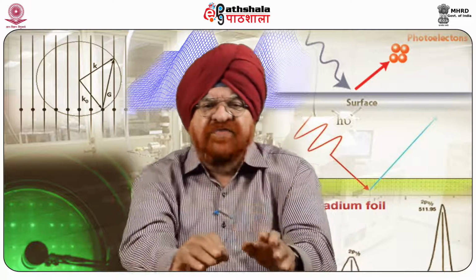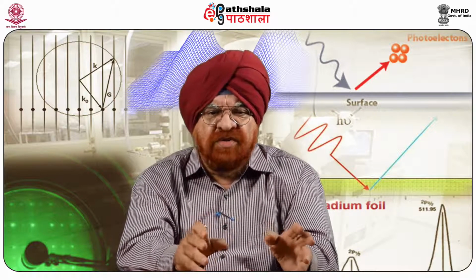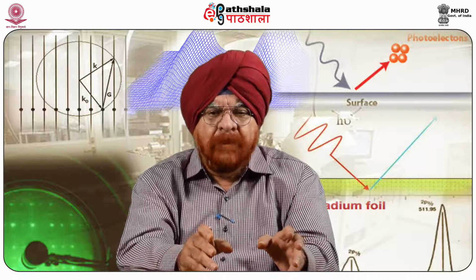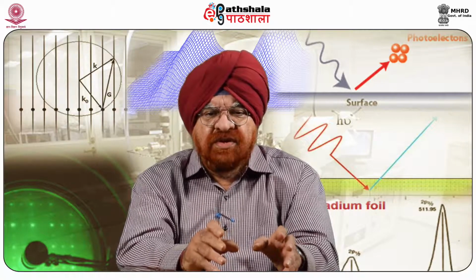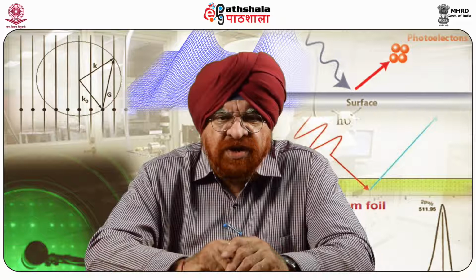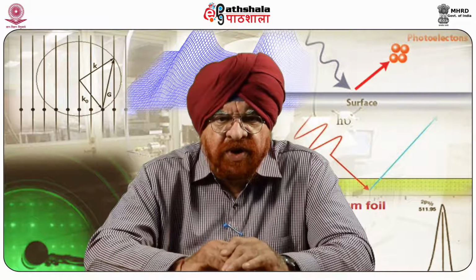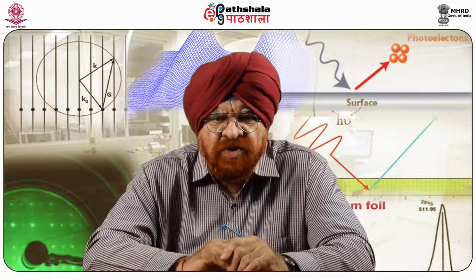Analytical reports of AFM results include three-dimensional images and quantitative data analysis such as feature sizes, surface roughness, and area. Cross-section plots can be interpreted in the context of your problems.